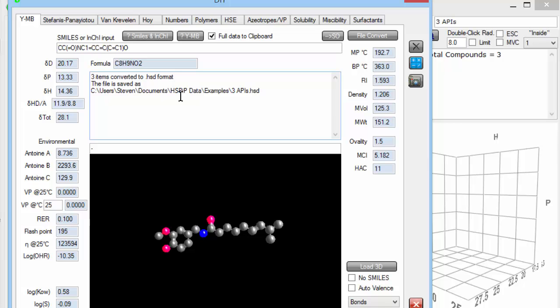So we have a powerful general technique for estimating properties automatically. There are other methods available. The Stefanis-Panayutu, van Crevelin, Hoy. You can do it via thermodynamic numbers. And this same form also has ways of doing things with polymers, health and safety, azotropes, vapour pressure, solubility, miscibility, and surfactants.